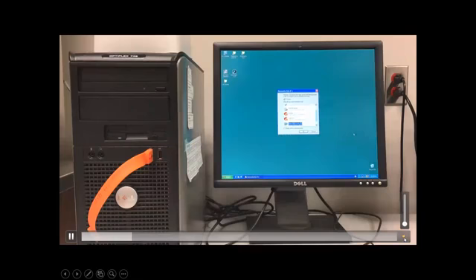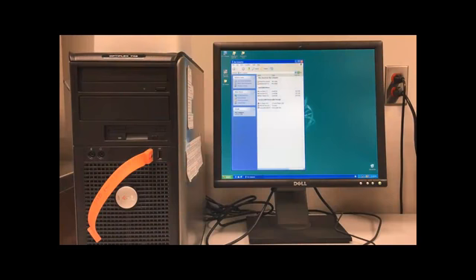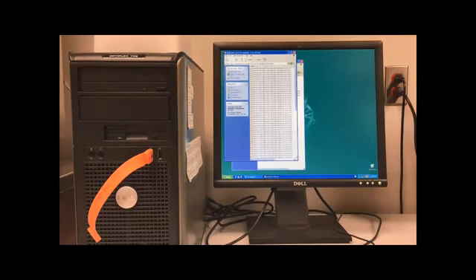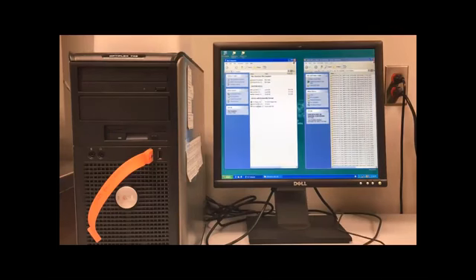Okay, so here the USB drive has now been inserted into the other computer. We're going to do a very similar thing. We're going to copy everything from that USB drive, which will be the 1123 files, onto that center one, which is called something like original 2020 to 2021. So whatever semester and year it is, that's what we're going to go into.